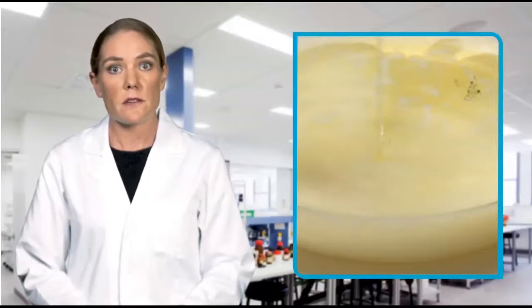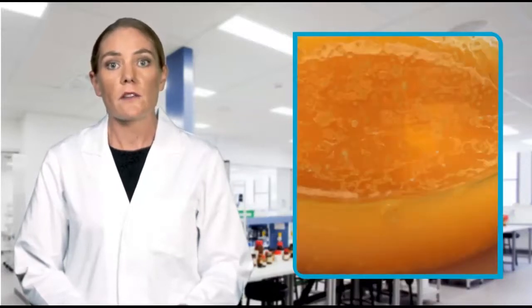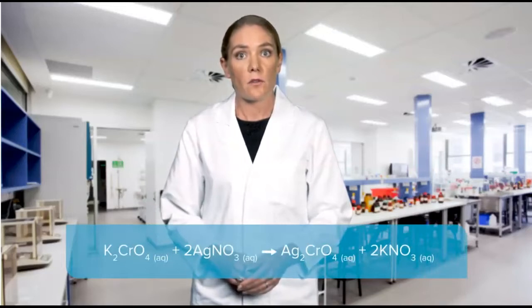When the reaction reaches the equivalence point, all of the chloride ions have reacted to form a precipitate of silver chloride. When more silver nitrate is added, the potassium chromate undergoes a colour change, forming an orange-red solution. This is because once all of the chloride ions have reacted, the silver nitrate then reacts with the potassium chromate, which makes it change colour, according to the equation shown, where now silver chromate and potassium nitrate form.